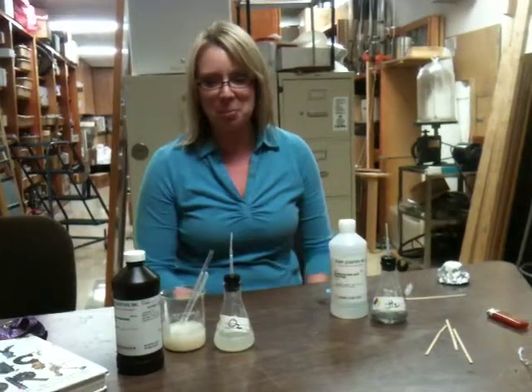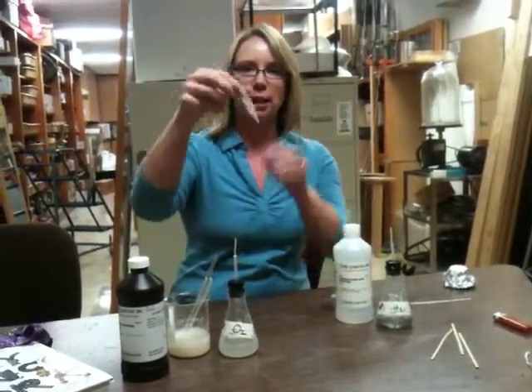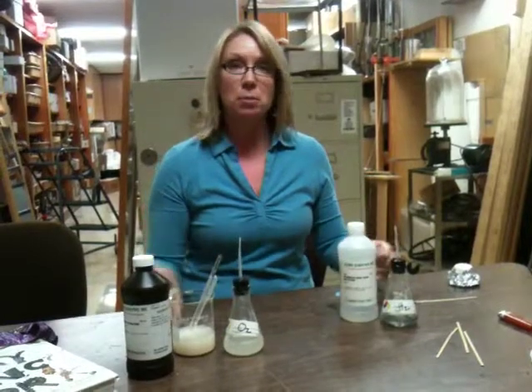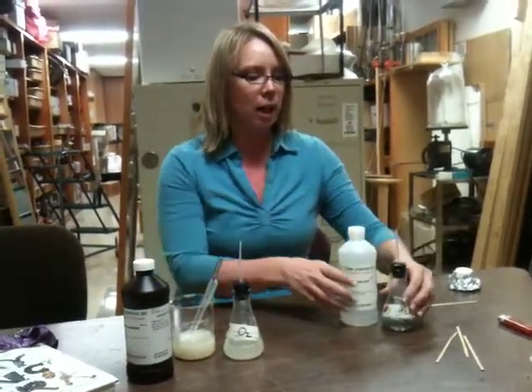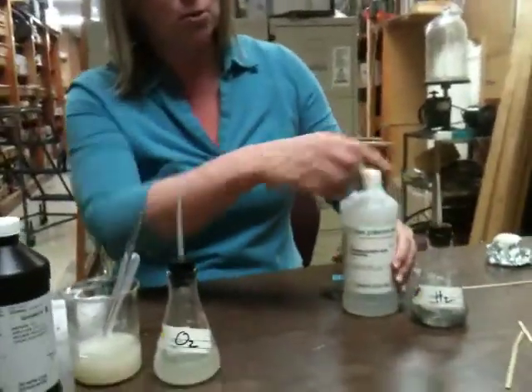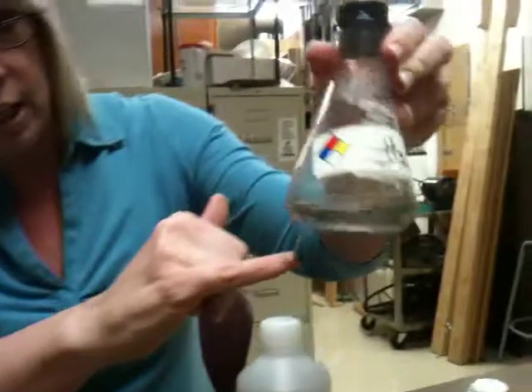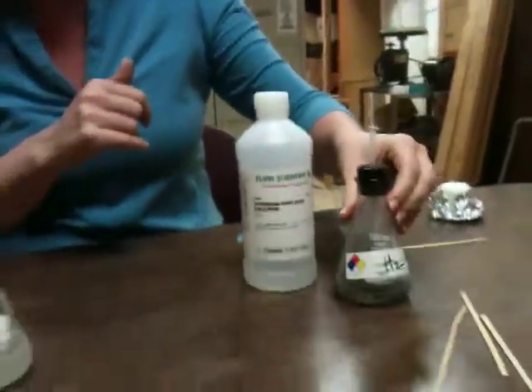I'm here talking to you about how to collect gases in your little rocket. This will serve as your rocket once we move farther along in the project. So just like before, you're going to collect hydrogen and oxygen gas. When you collect hydrogen, you're going to use the flask that says H2, and you're going to use 3 molar hydrochloric acid. And I've already got some zinc in here. It's hard to see, but you need about 4 pieces. And then your hydrogen is ready.